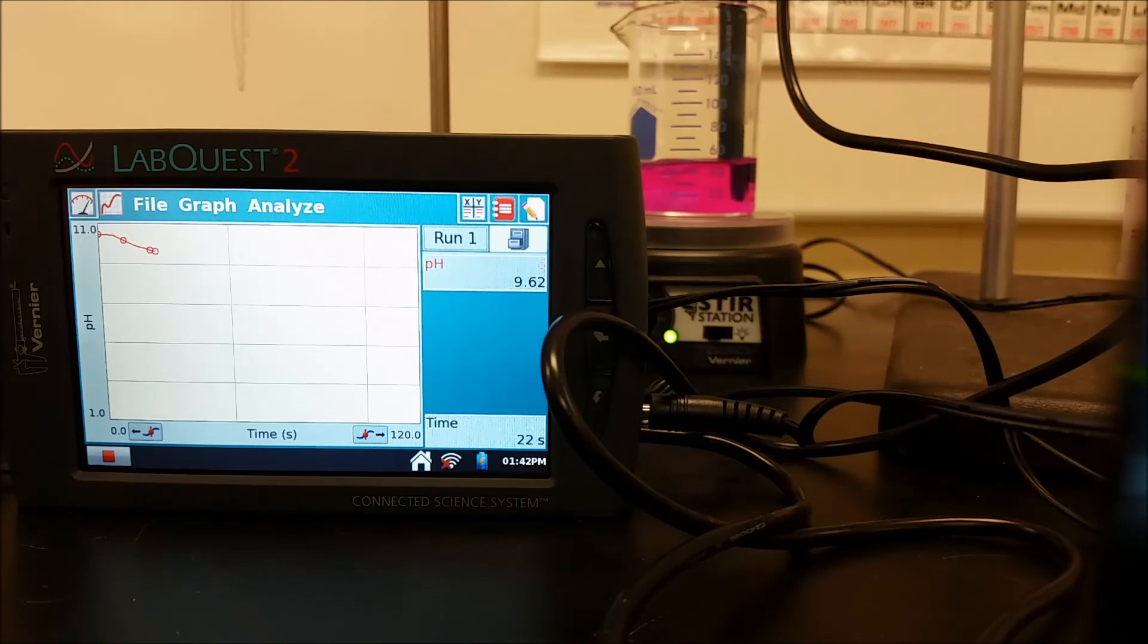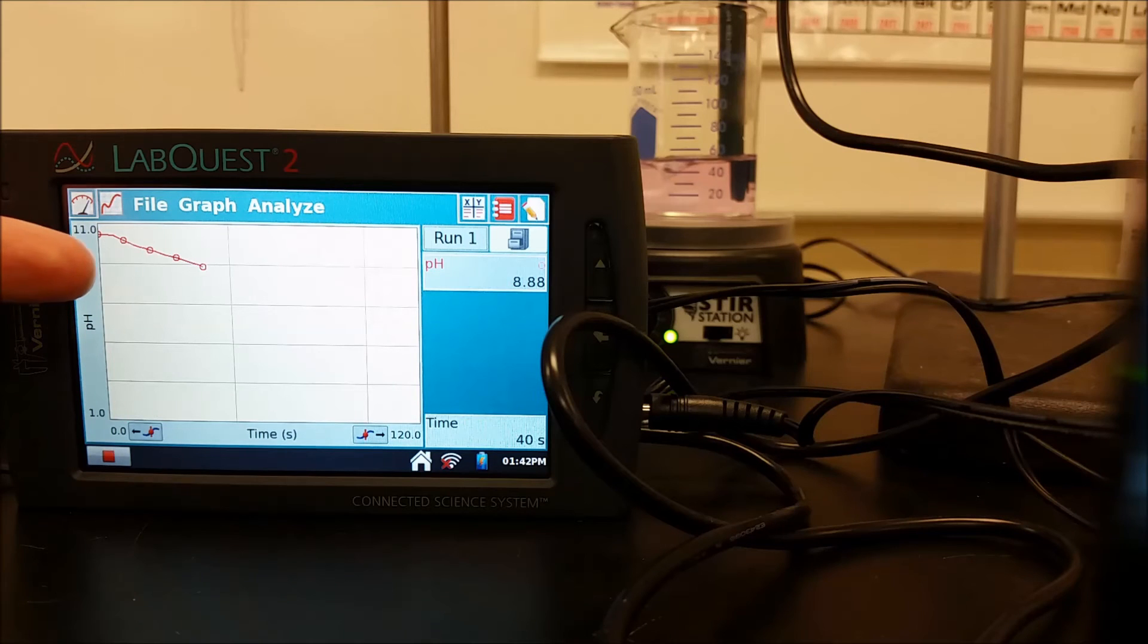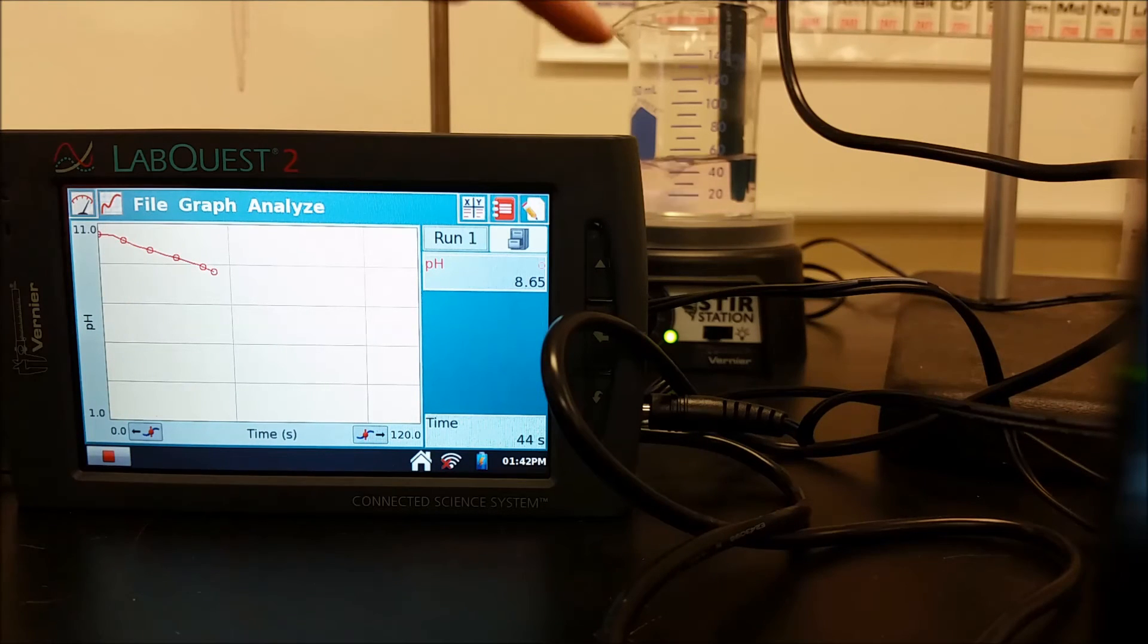You can see the pink color is starting to get a little bit lighter, and then pretty soon it's going to fade away to colorless, and we're still in the middle of our buffering region. So right now we're getting very faint, and now it looks like we've gone to colorless, but if you look on the screen and the titration curve, we're not at the point where we're at our equivalence point.